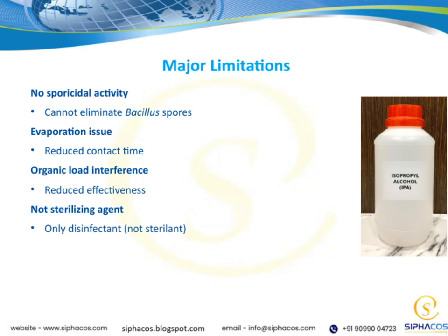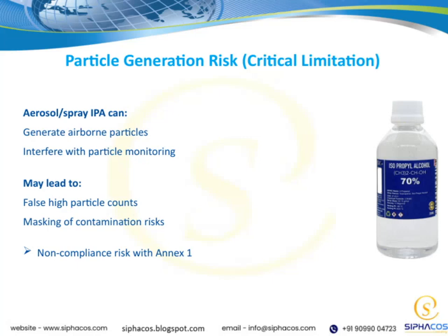more critical sterilization needs. Let's talk about the particle generation risk associated with aerosol or spray IPA. One of the critical limitations here is that IPA can actually generate airborne particles itself. This means that when we use it, we might be unintentionally adding particles to the environment, which can interfere with our particle monitoring efforts. This is particularly important because if the aerosol creates extra particles, it can lead to false readings, giving us a falsely high particle count.